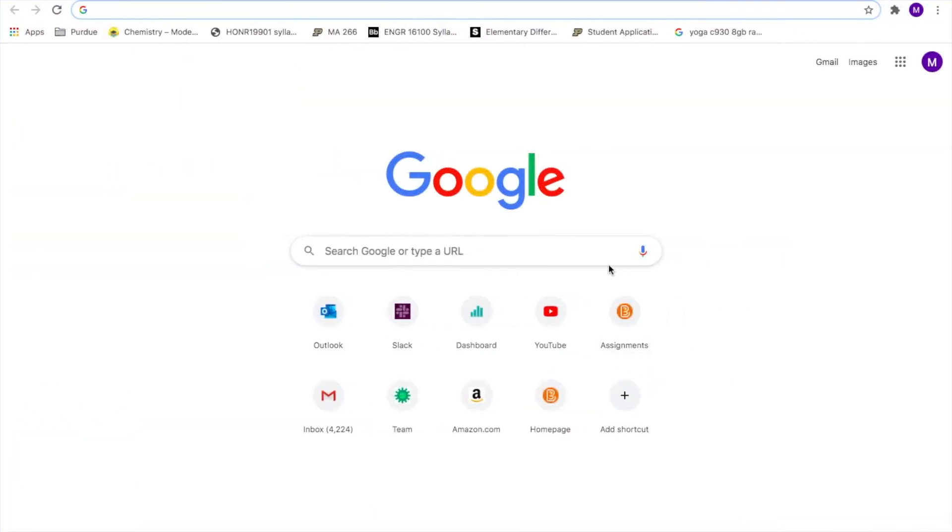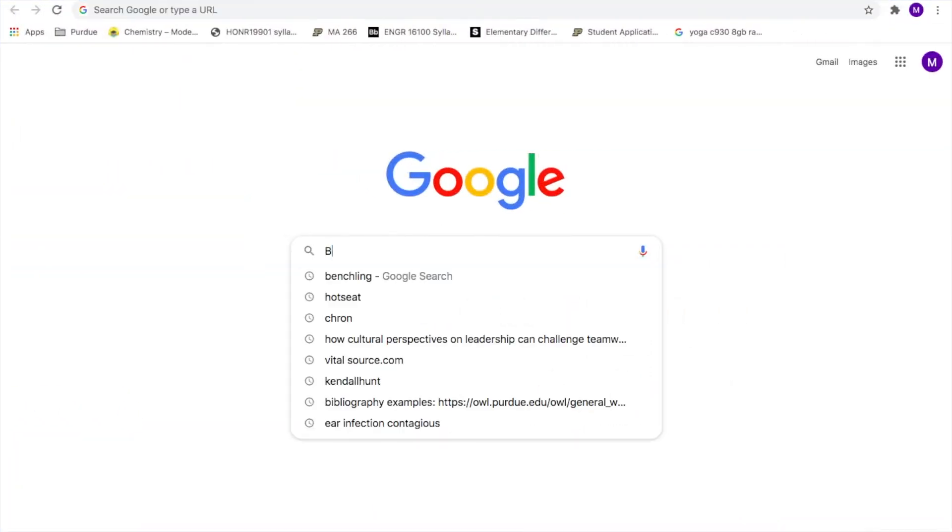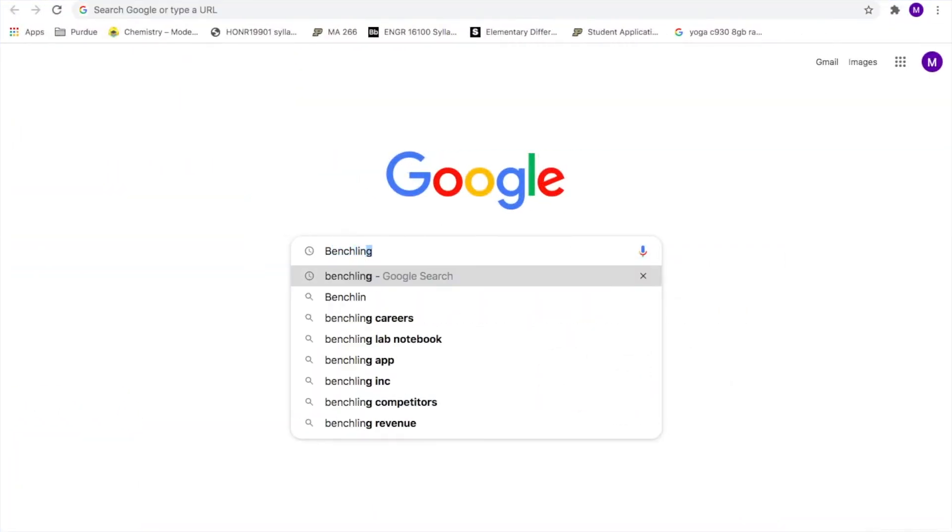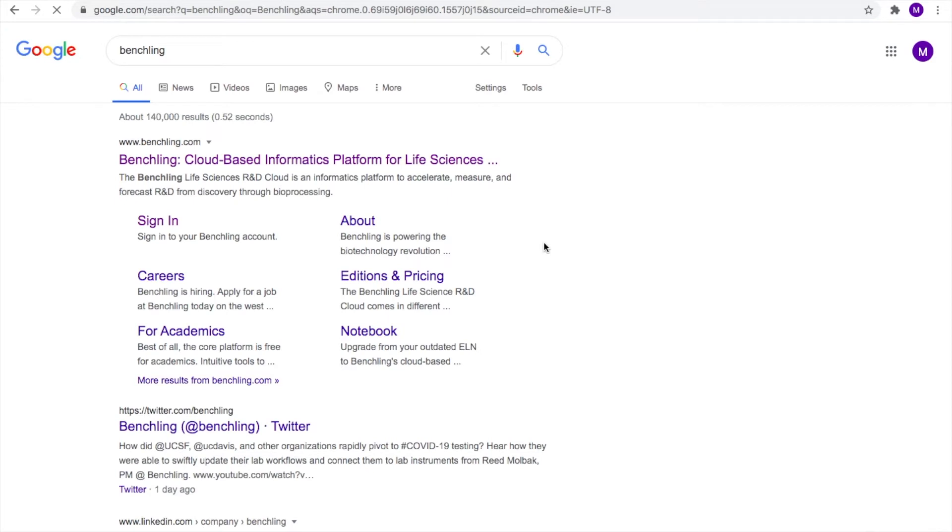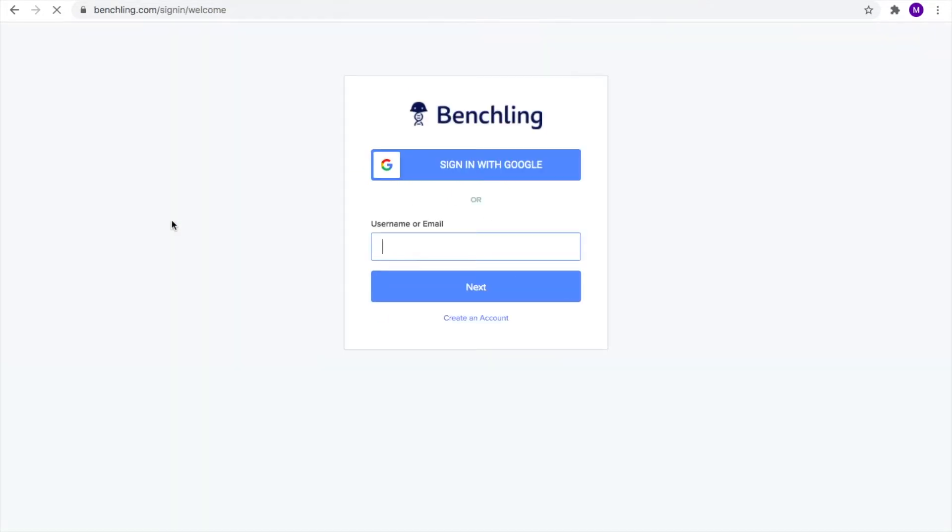The first step is to create an account with Benchling, which is free to use. If you don't have one, pause the video and click on the link to set one up. Now that you have an account set up, let's get started!